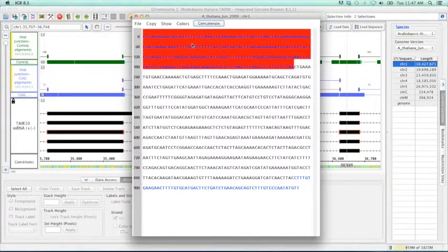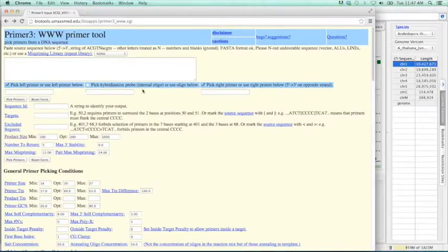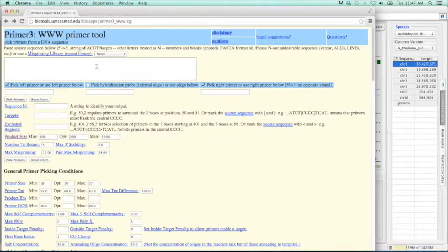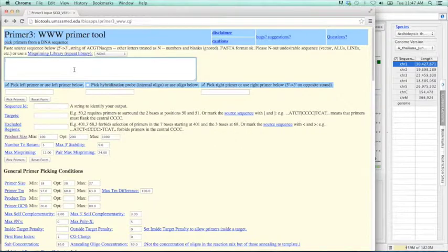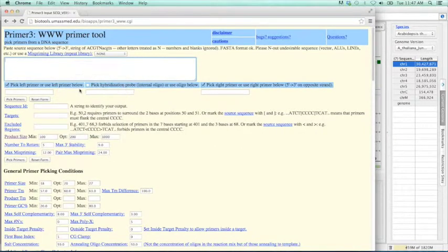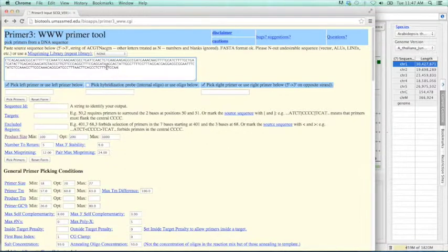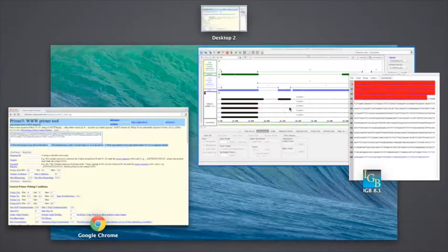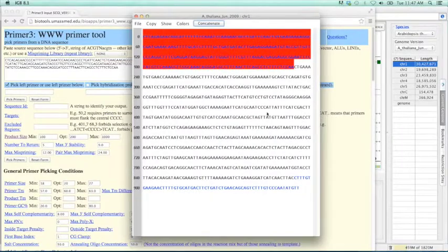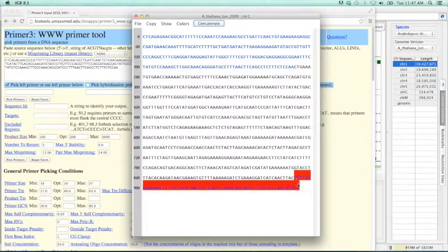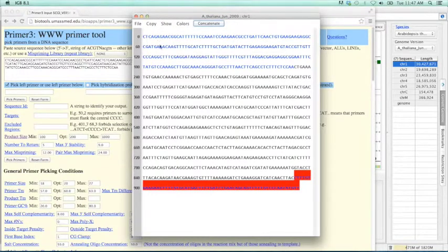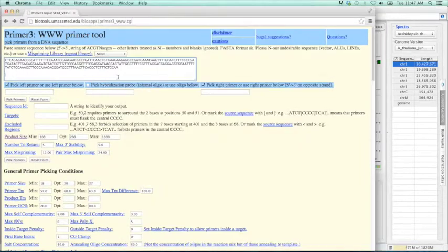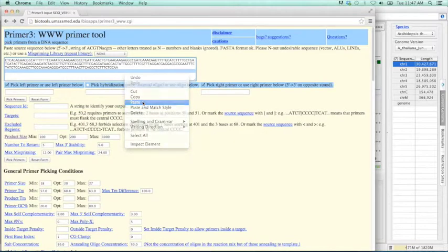The program is called Primer3. It is well regarded in terms of designing primers. And this is what we ourselves use. Primer3 is freely available online. I'm going to paste that first exon in here. And then I'm going to hit enter twice. We'll see why I do that here in a second. So let's jump back to IGBI. Let's highlight our second exon. And copy. And paste.